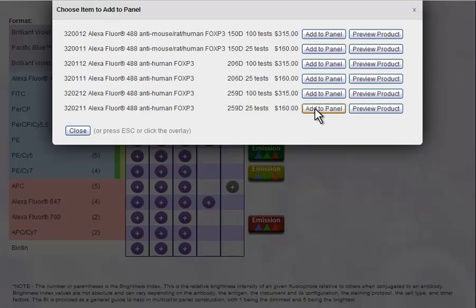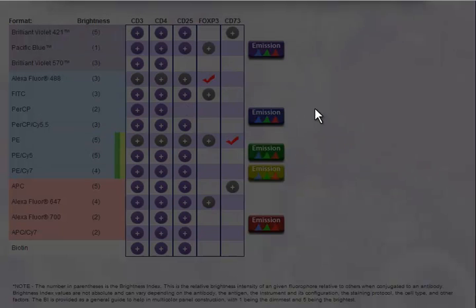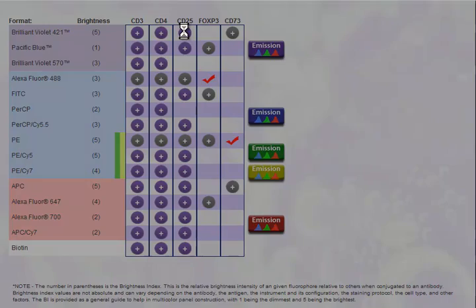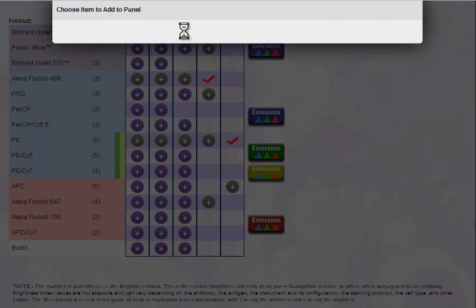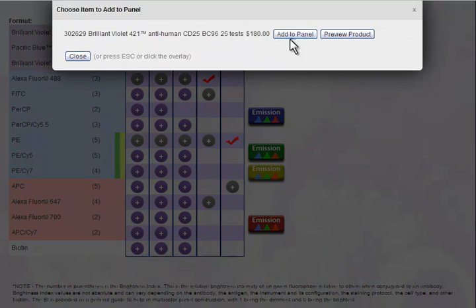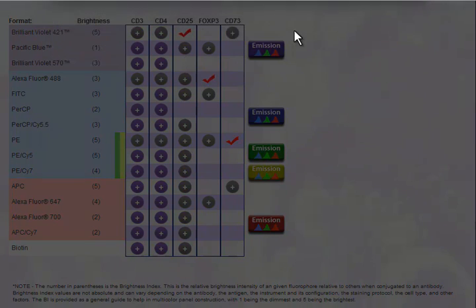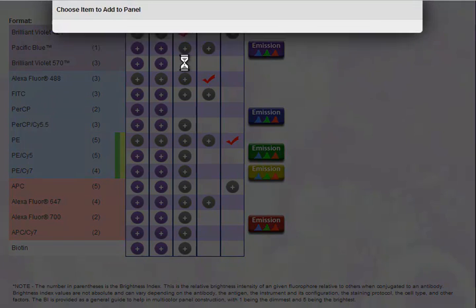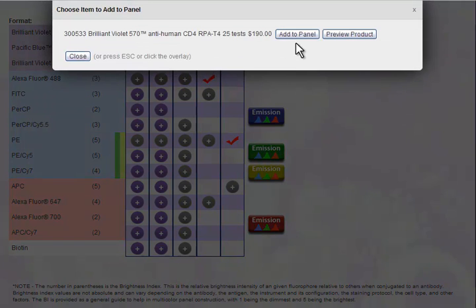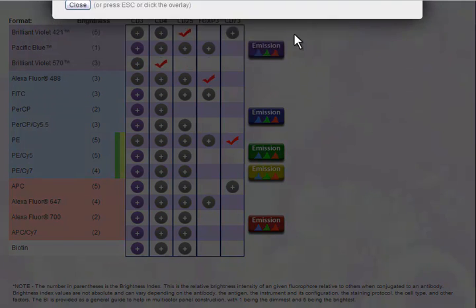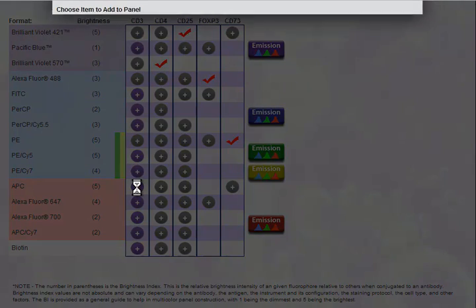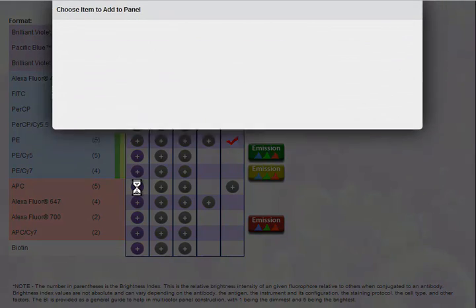Continue through with all the other specificities until you have completed your panel. Be sure to select your brightest fluorophores such as Brilliant Violet 421, PE, and APC for your most weakly expressed antigens, and that way you can reserve the more dim fluorophores for your more highly expressed antigens.